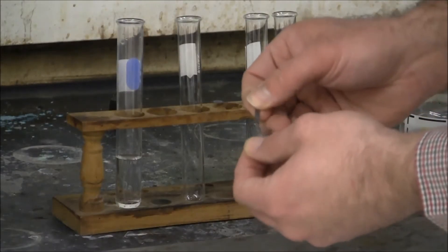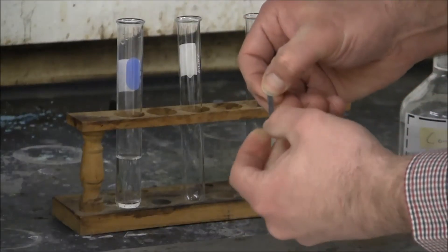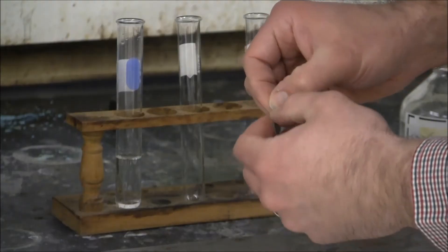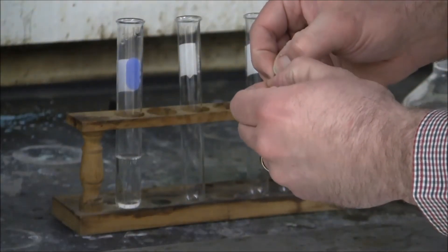I'm going to place the magnesium in there. The magnesium has an oxide layer on the outside, so it's kind of silvery but it has that black oxide layer on the outside. It should slow the initial start of the reaction, but it should still give us the same effect.